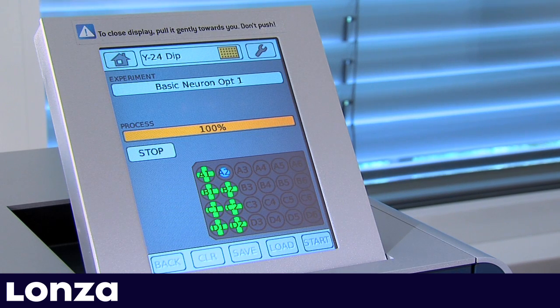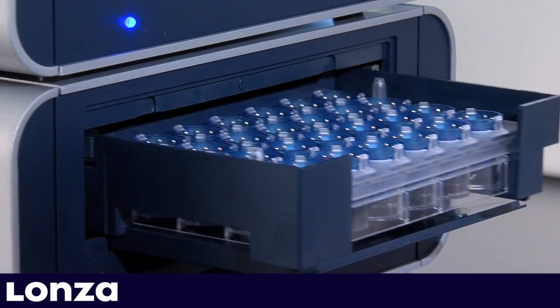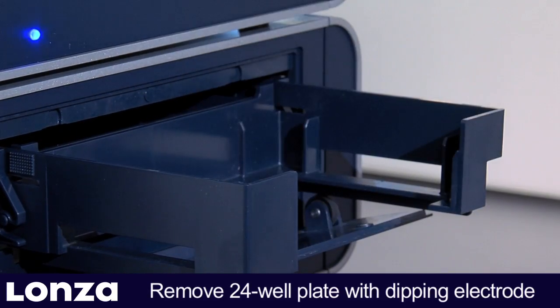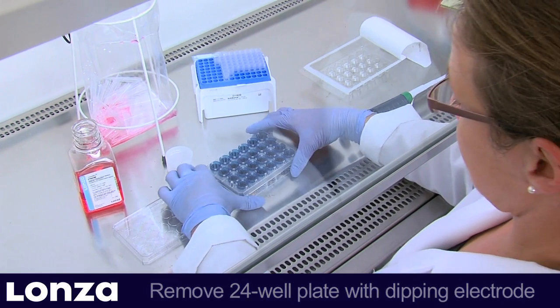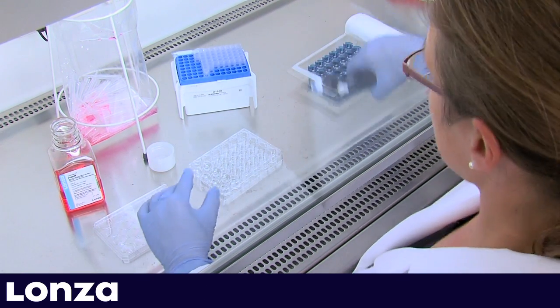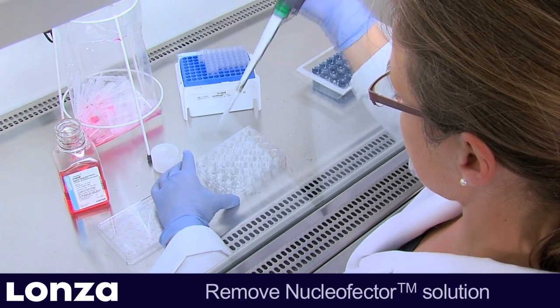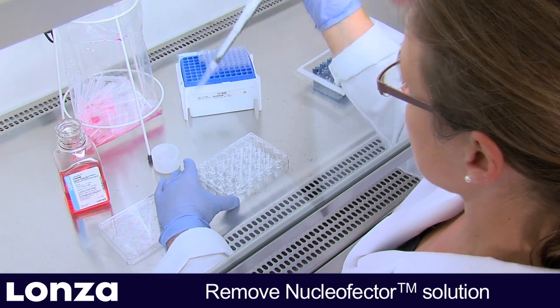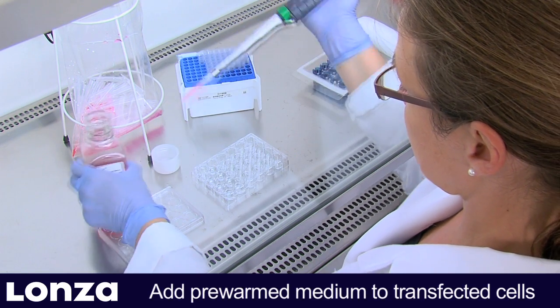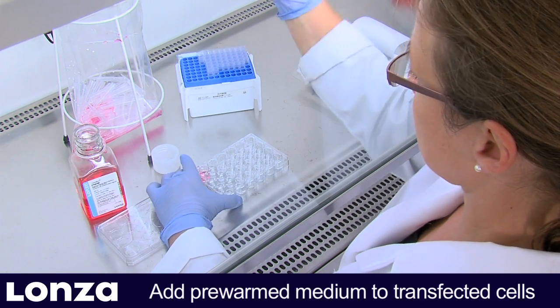As soon as all wells have been processed, the retainer opens automatically. Take out the 24-well plate and carefully remove the dipping electrode without spilling liquid between the wells. Then remove the Nucleaffector solution by pipetting and add pre-warmed culture medium to each well. Handle each well individually.